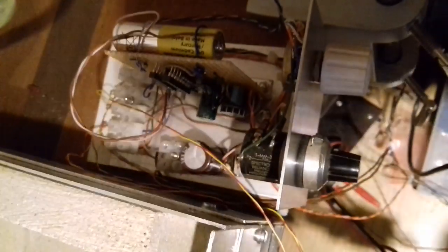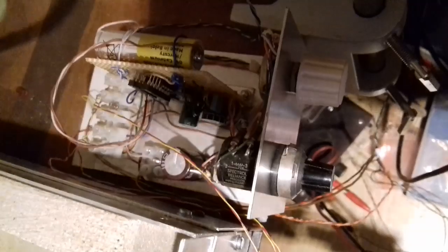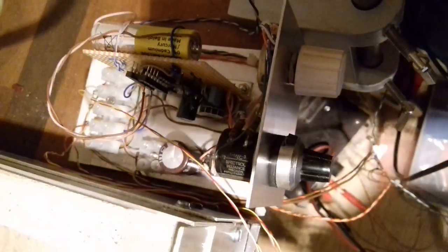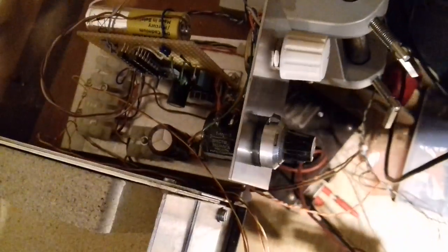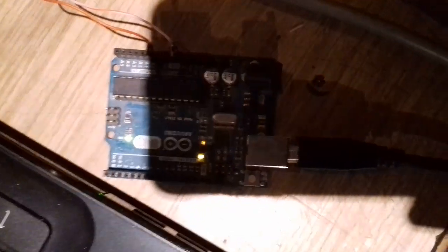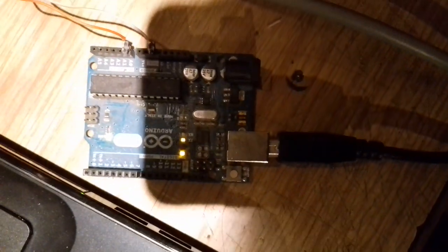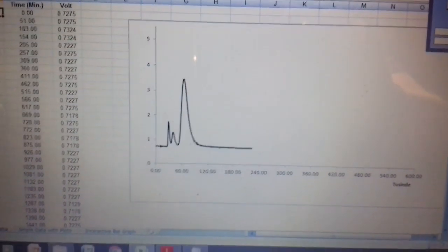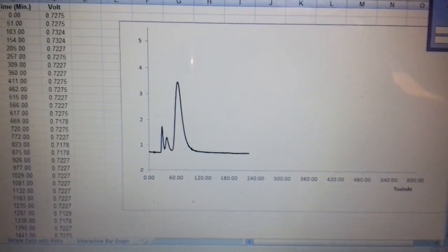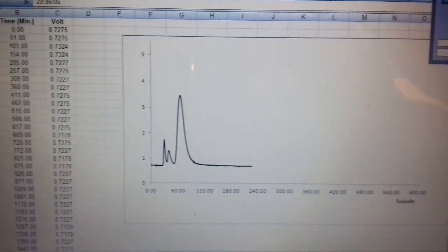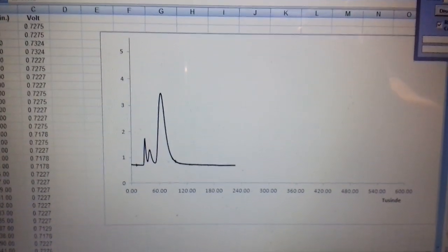I can then set the zero point of the detector and set the gain. I've run that over to an Arduino Uno that just logs that and plugs it into Microsoft Excel. That works fairly well.